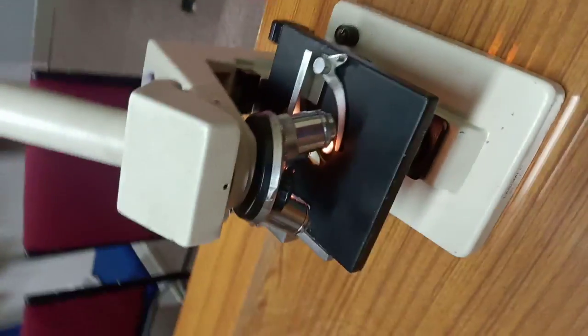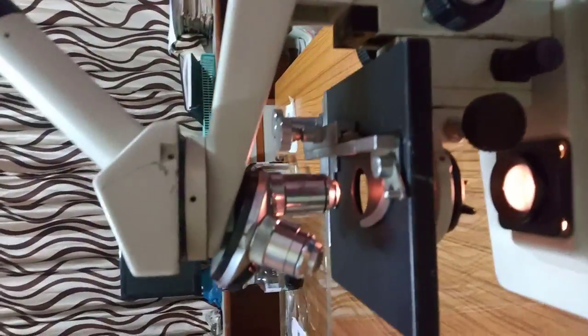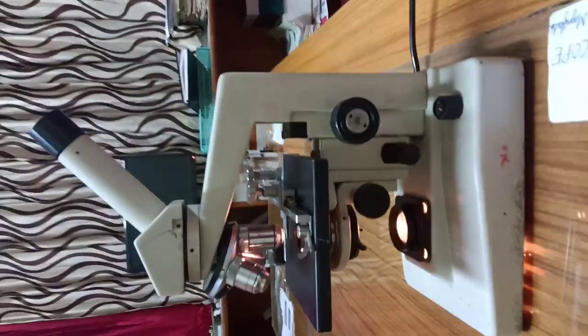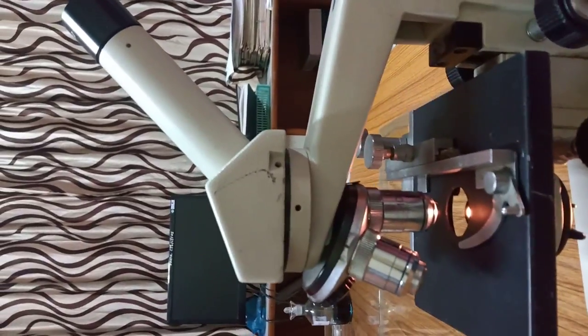The primitive microscope used by Robert Hooke, students, was very simple and consisted of only a combination of magnifying lenses fixed in a tube. Compound microscope has a combination of lenses which comprises concave and the convex lenses.